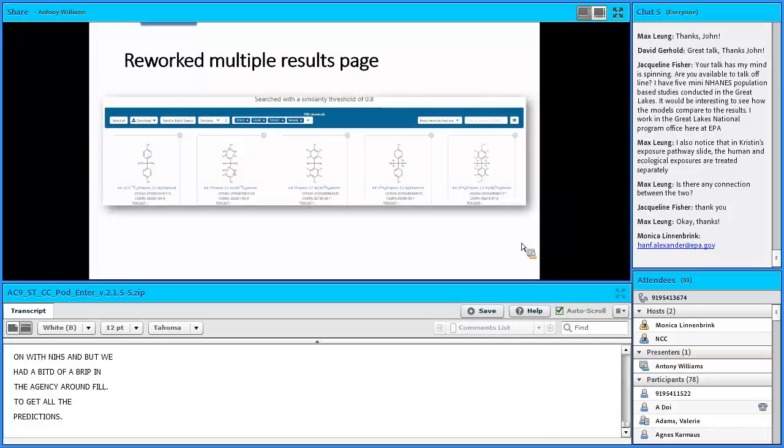isotopically labeled compounds. You can see in the top 5 here, every one of those is isotopically labeled. We have C13 labeling, deuterium labeling, and you might not be interested in that. You're not going to care so much about these isotopically labeled compounds. So you would hide chemicals that are select isotopically labeled.